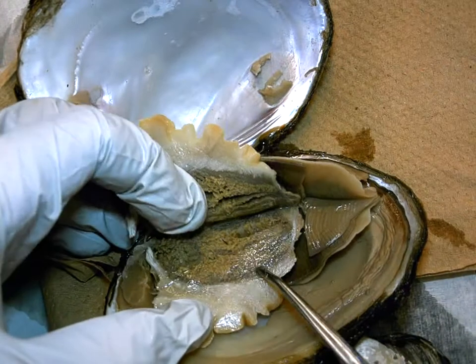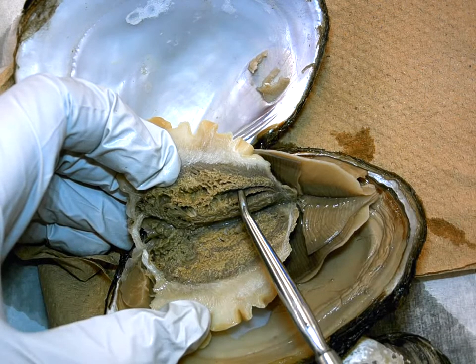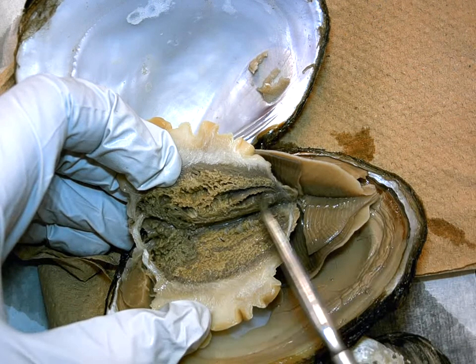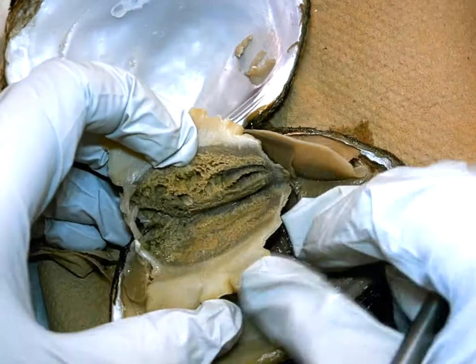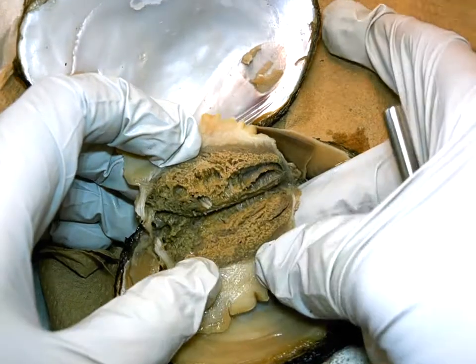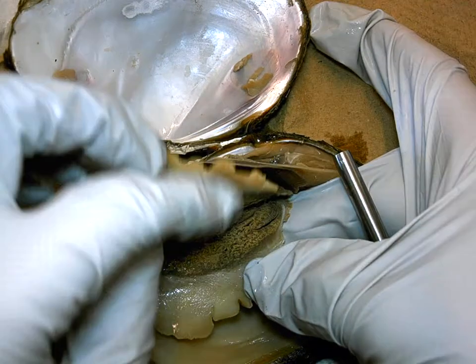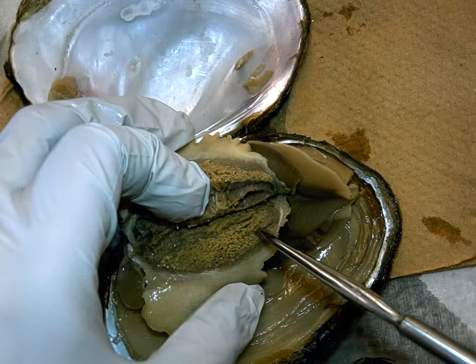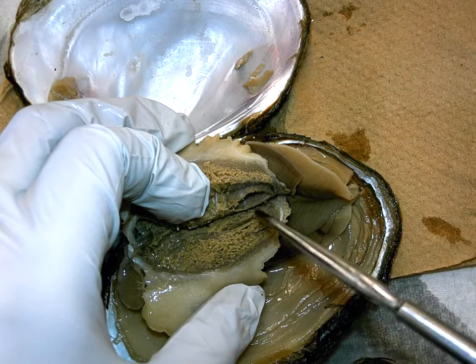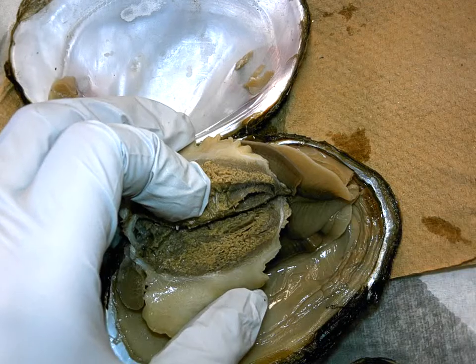Now what the intestine looks like is really, and I'm hoping you can see this in coloration, it's kind of these dark brown little pathways that we see running through the tissue. Let's see if I can pinch this one a little bit and get it to show up. Exactly, so right there you can kind of see what look like little long little curvatures that open up, like right here, which are tubes of the intestine that we technically, when we sliced it, we sliced through the tube, so we're seeing half of the tube there.